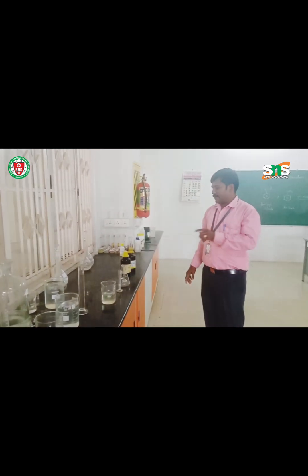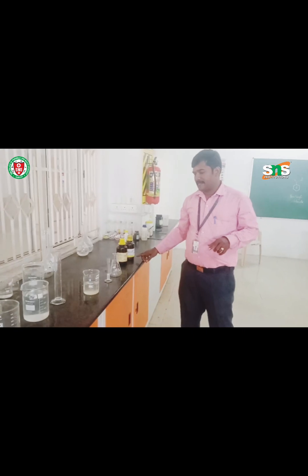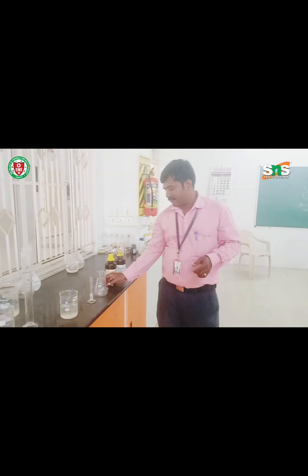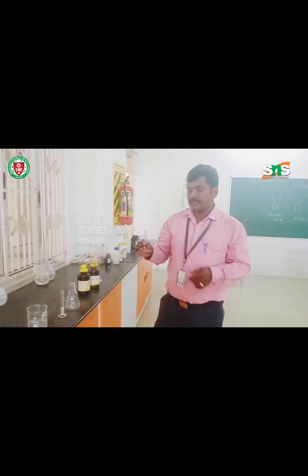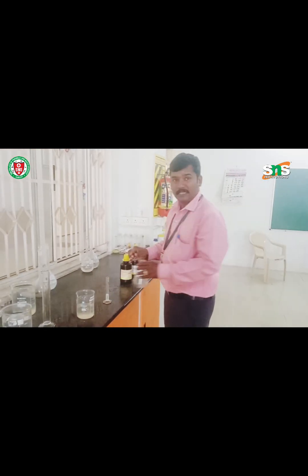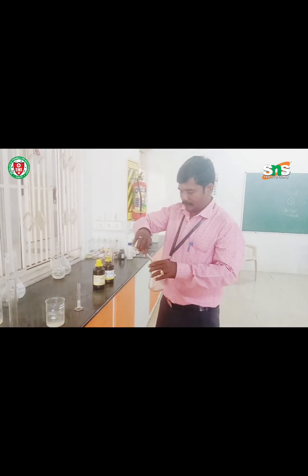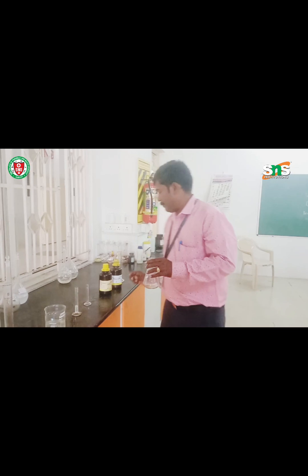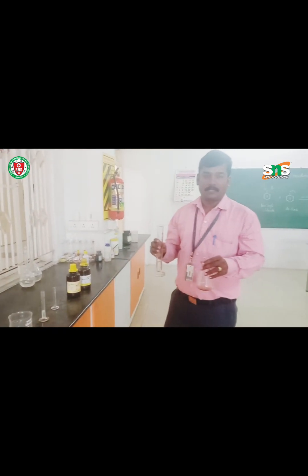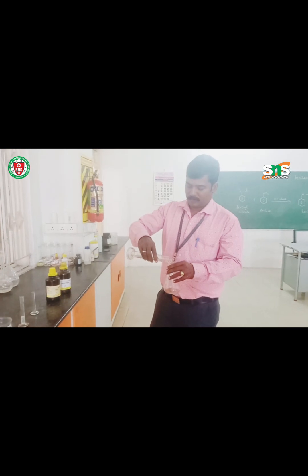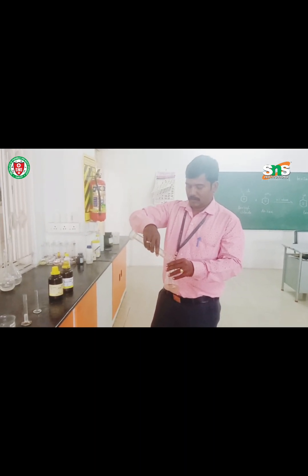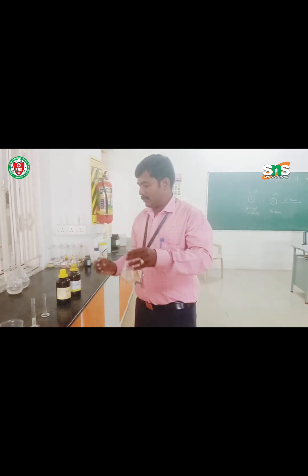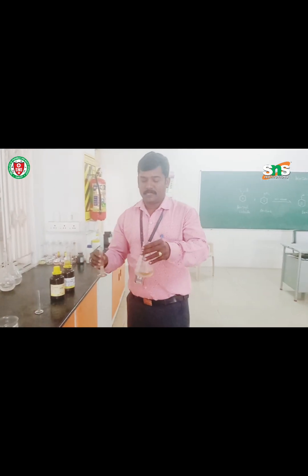As I have already mentioned, we require aniline, benzoyl chloride, and 10% sodium hydroxide for the synthesis of benzanilide. Now I have taken 2 ml of aniline and I am going to transfer this into the conical flask. Afterwards, I am adding 30 ml of 10% sodium hydroxide, which will act as a catalyst. Now I am going to add the benzoyl chloride.